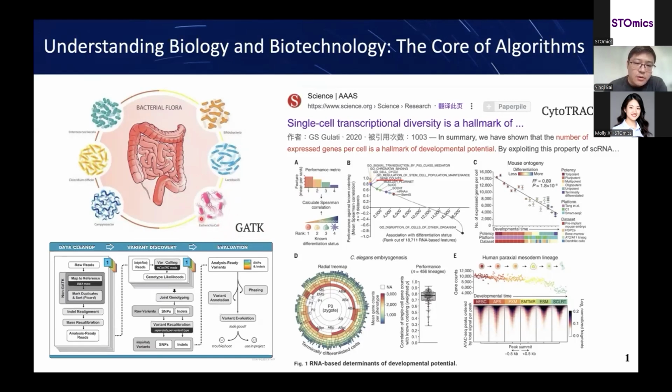However, for bacterial population, most of bacteria only have the monoploid, and they only have 4 types of the genotypes. So we use a diploid modeling to get the population analysis for bacteria. The concept is wrong, so he could never get the right answer for this analysis.